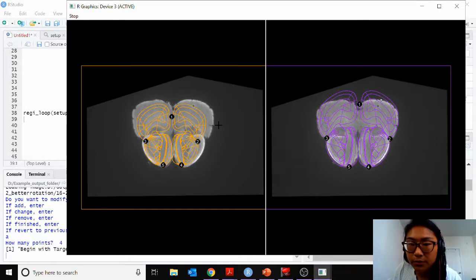And see how that looks. Right? And again, I'm trying to keep even.